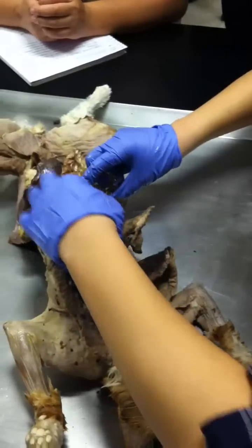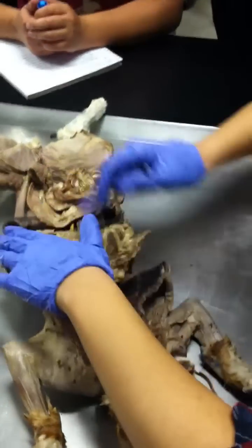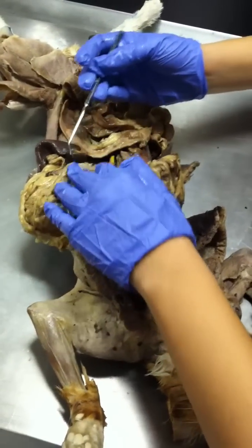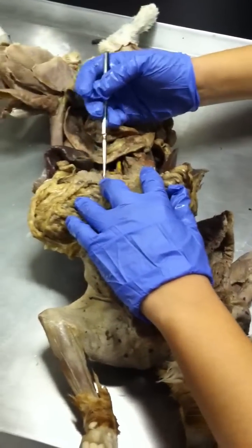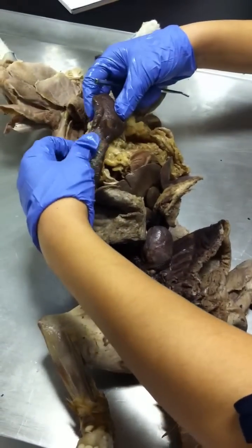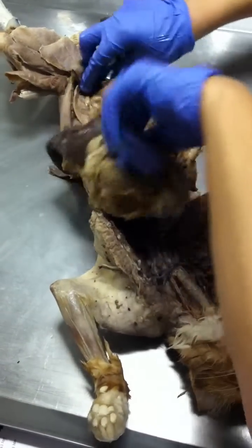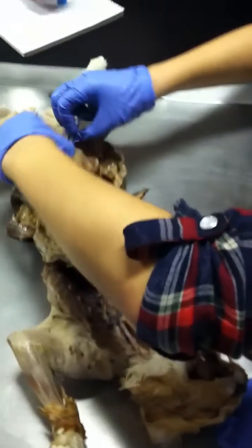Okay. Cool. You guys remember the location of the pancreas? Alright, this right here. Underneath the greater omentum. Underneath the greater omentum. Right. With this consistency, you know, okay, definitely that's gotta be the pancreas. This is the pancreas. Do you guys remember what this was? Spleen. Spleen. Right, excellent.